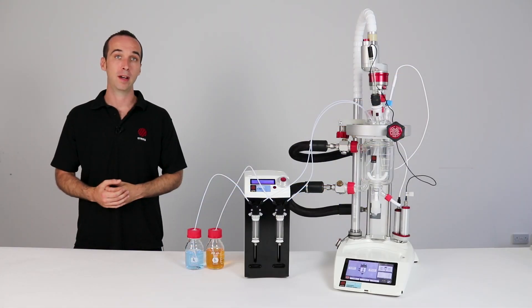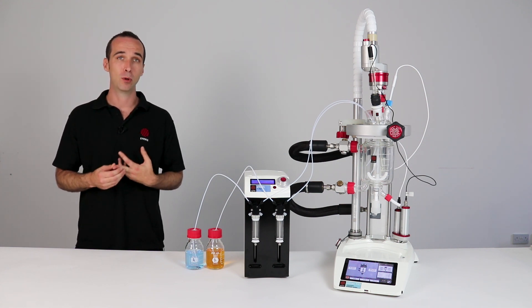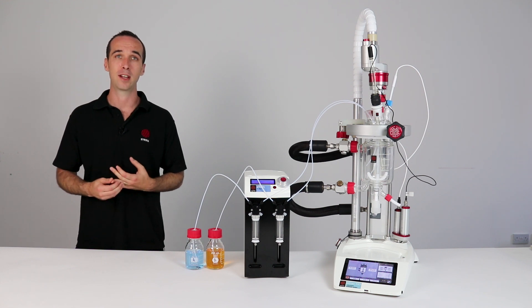In conjunction with the Atlas pump, Atlas HD can perform a variety of complex dosing procedures such as pH control and the ability to pause dosing or abort it based on the sensor condition.